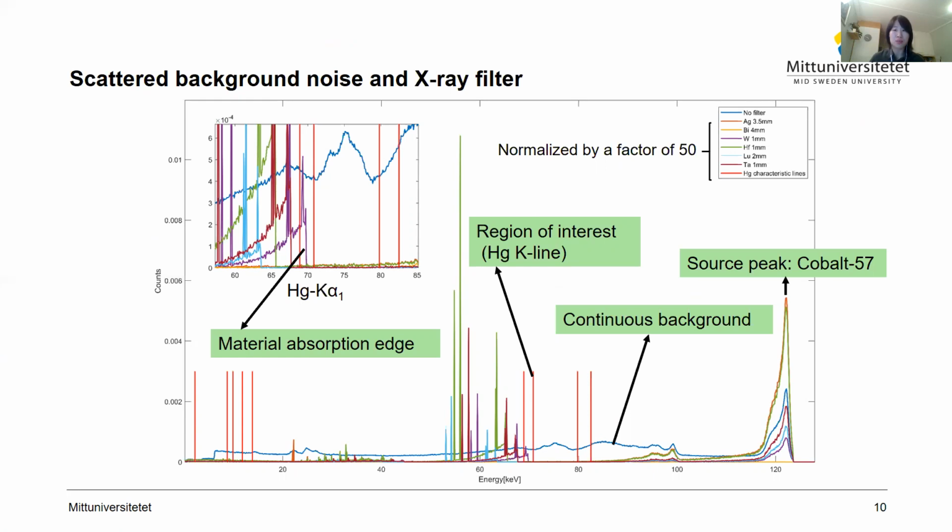As shown in the blue line without filter, the full spectrum from low energy to high energies overlaps with the peak from mercury, and then the intensity of the mercury will be underestimated since these peaks might be hidden in the spectrum.